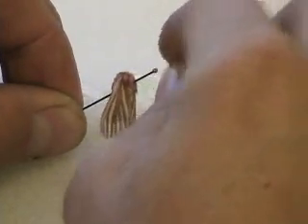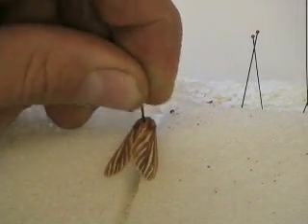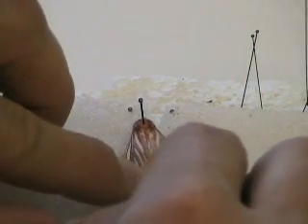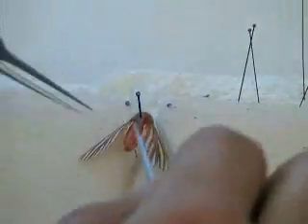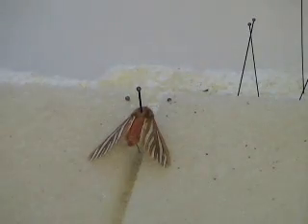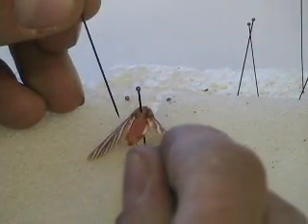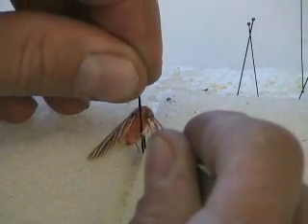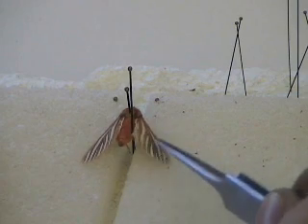Once you've pinned your specimen, take it and put it on your pinning block, placing the pin in one of the grooves so the thorax and body are in the groove of the foam. I want to carefully spread the wings out by going underneath the wing and lifting up with the forceps — just sliding underneath, not gripping. I also use a base pin placed on the side of the abdomen, not through it, so that when I move the wing the whole body doesn't turn.